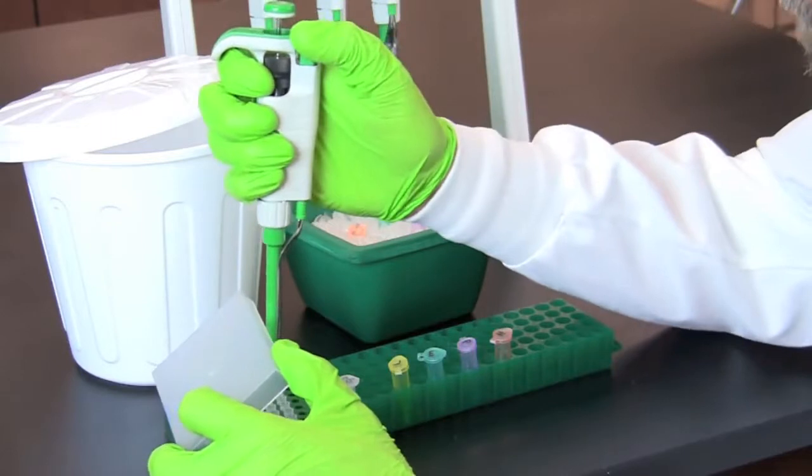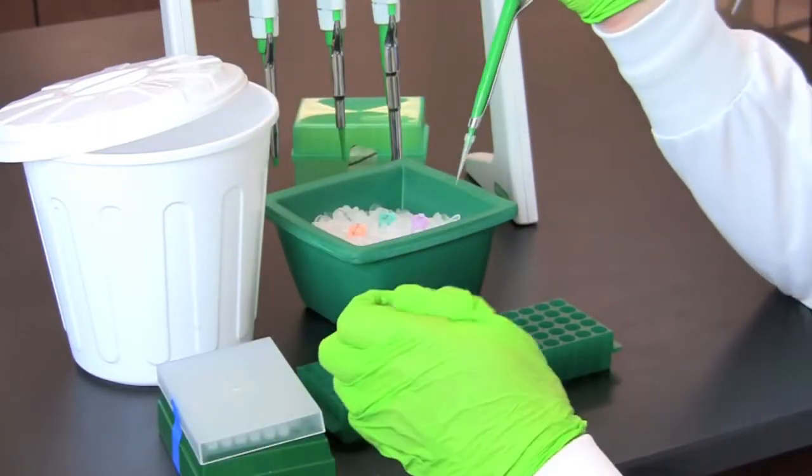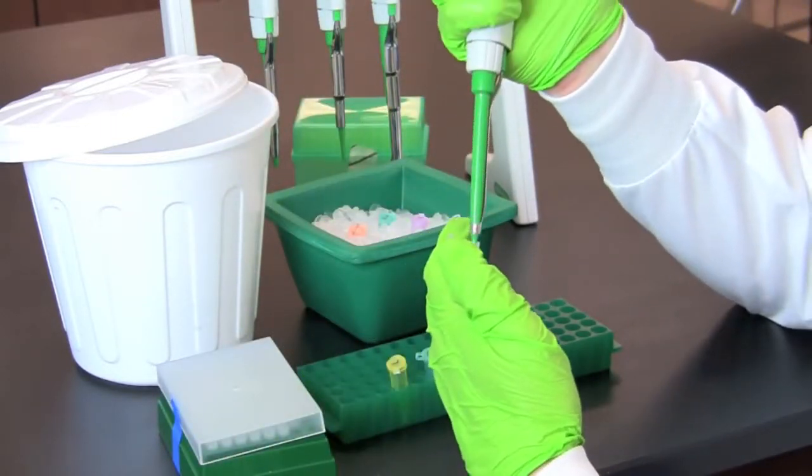Continue this procedure using the same volume of five microliters to transfer restriction buffer to the tubes labeled P and H.